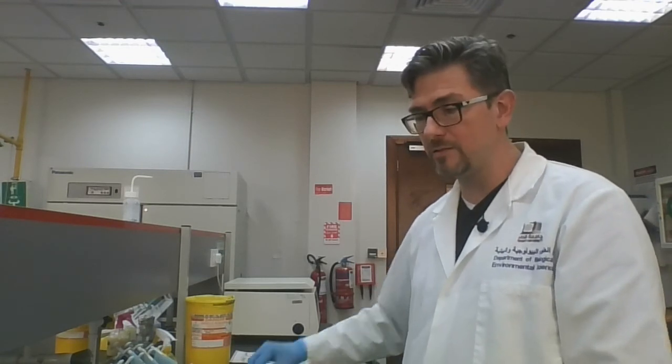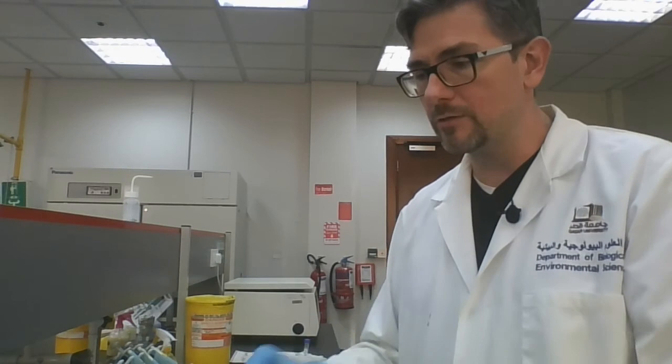Okay, so we're done with our incubation. We're going to place our samples into the centrifuge for 5 minutes, and we're going to try to collect all of our DNA from these samples. Again, when you put them into the centrifuge, make sure that they are in a balanced configuration. And in this case especially, I would recommend that you make sure that the hinges of your epitubes are facing outwards. This way you know where to look for the pellets.